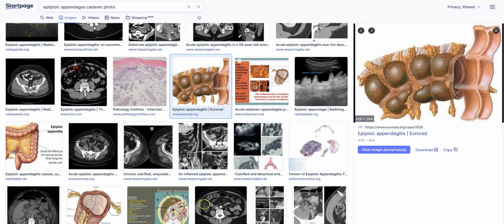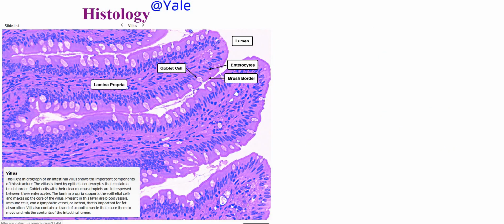So that is another way that you can identify it that makes it distinct from the other regions. As far as what they do, we have no idea. So that is an ongoing area of research. We don't know what they do, but we do know they are associated with the colon, mostly within the transverse and sigmoid regions.